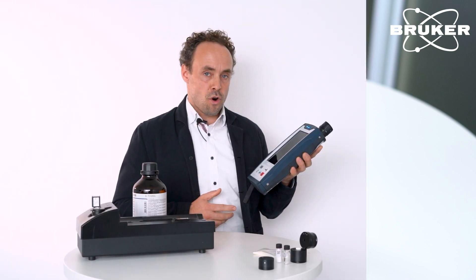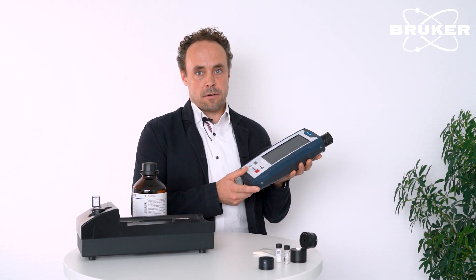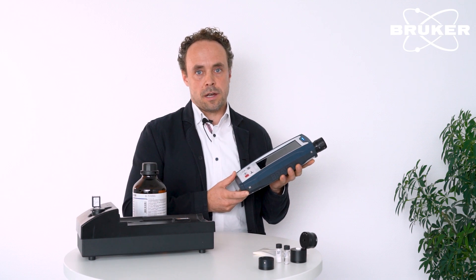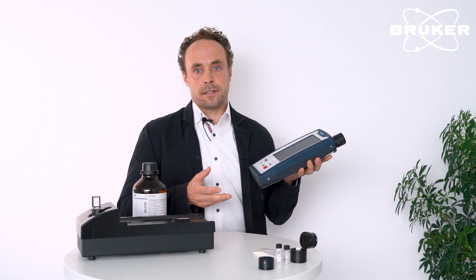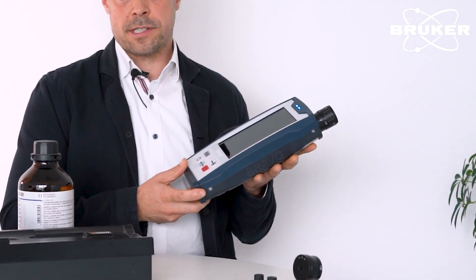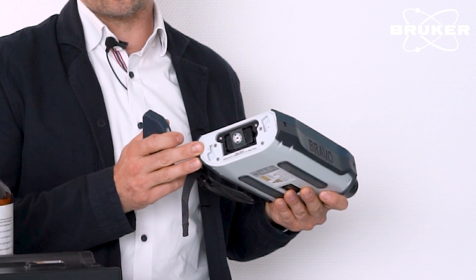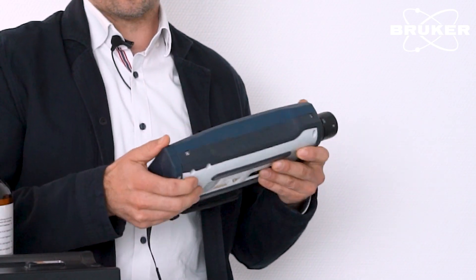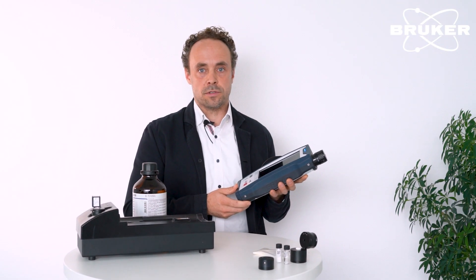The Bravo operates standalone, battery powered with around four hours operation time, of course depending on what kind of samples. It can take around 200 scans with a single charge. The battery is simply exchangeable and thus can be used in multiple shifts in a near continuous operation.